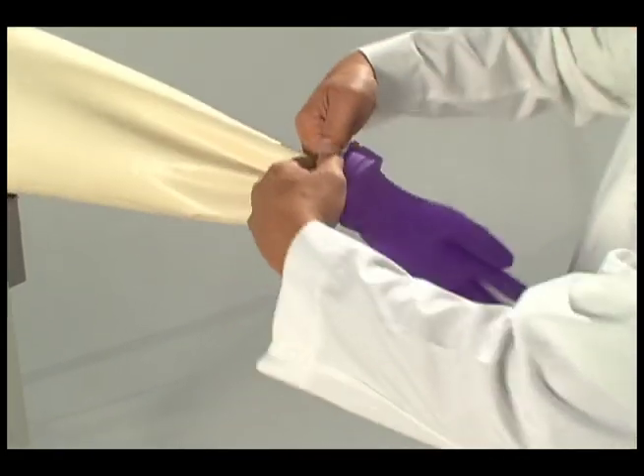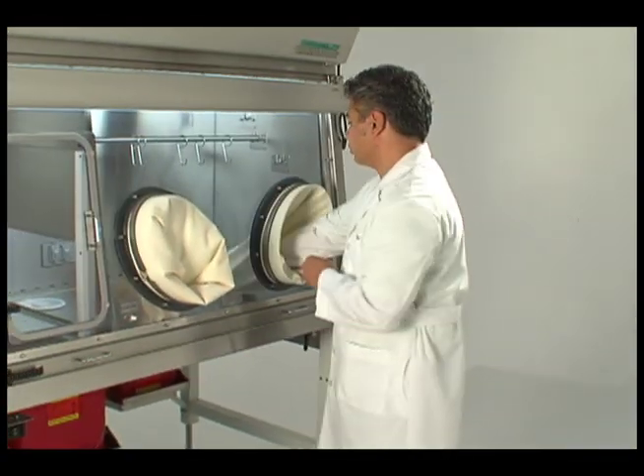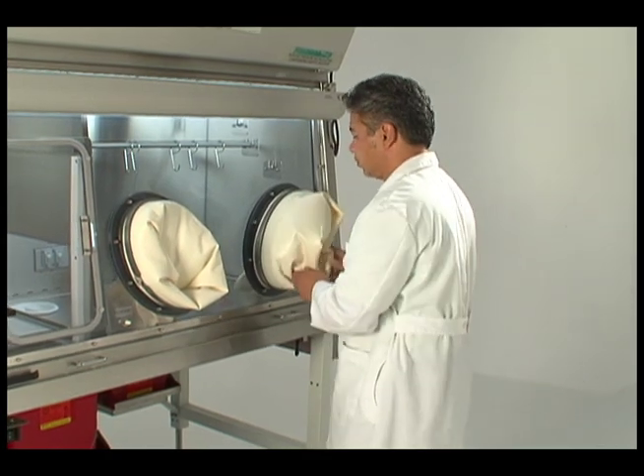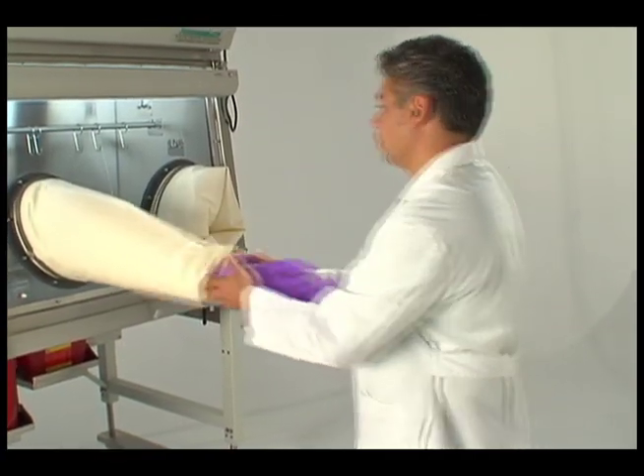Place the stainless steel holding spring back over the glove and ring, and push the glove sleeve assembly back through the glove port.